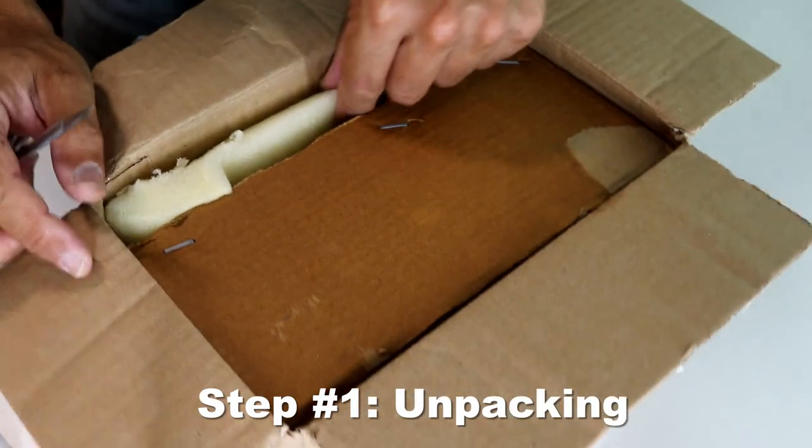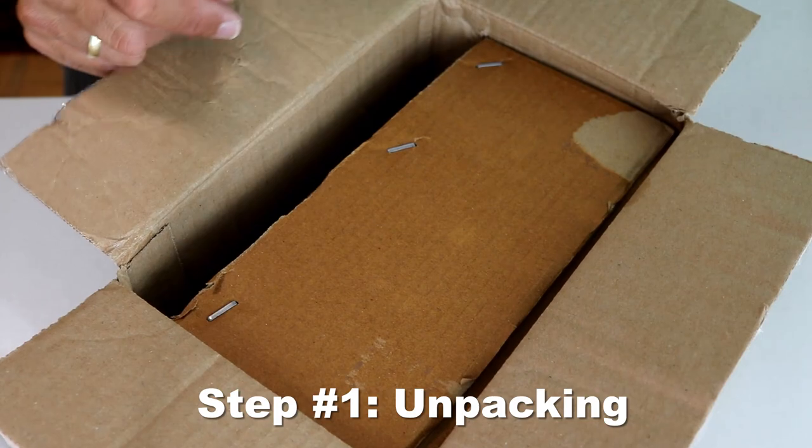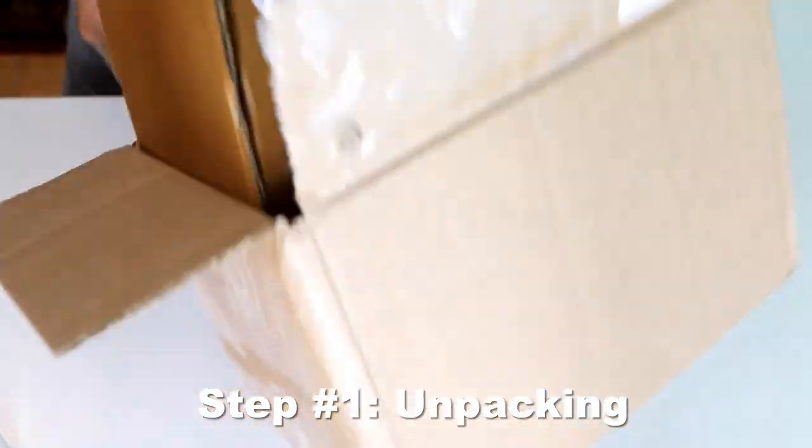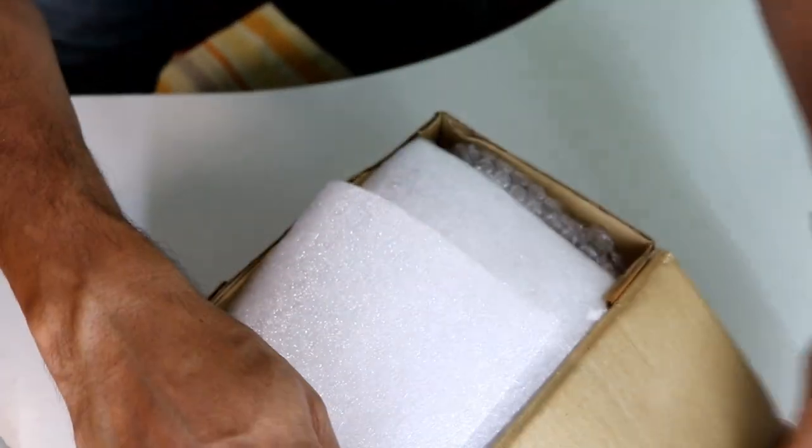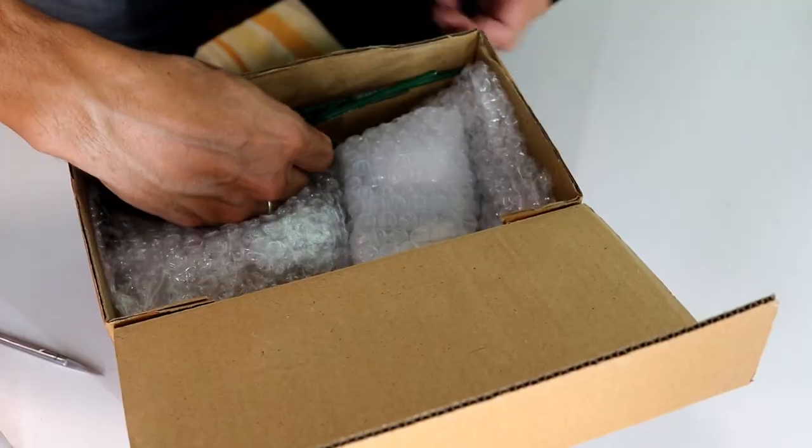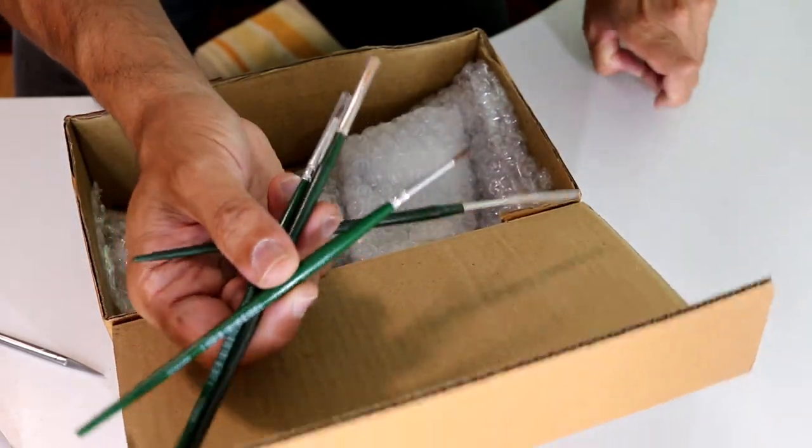I'm now unboxing the thing that I ordered. Inside the box there was another box, and this box was quite heavy, obviously because the slide ringing table is made of solid metal. The first thing that I took out were four brushes, and they are used to apply the ringing paint on the slide.